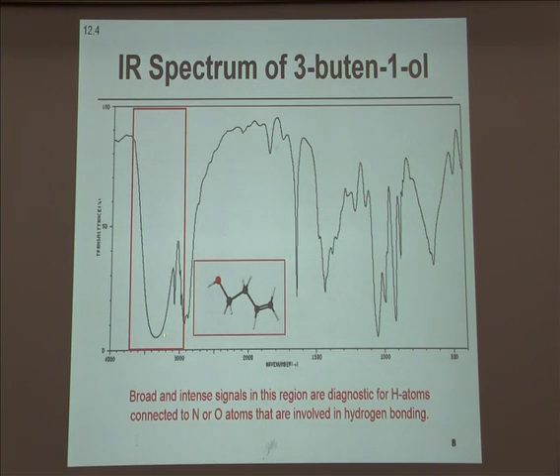In the gas phase, this OH signal is much, much smaller. If you diluted this alcohol in another solvent, we would also see the intensity decrease as those individual molecules were isolated and not hydrogen bonding as effectively.